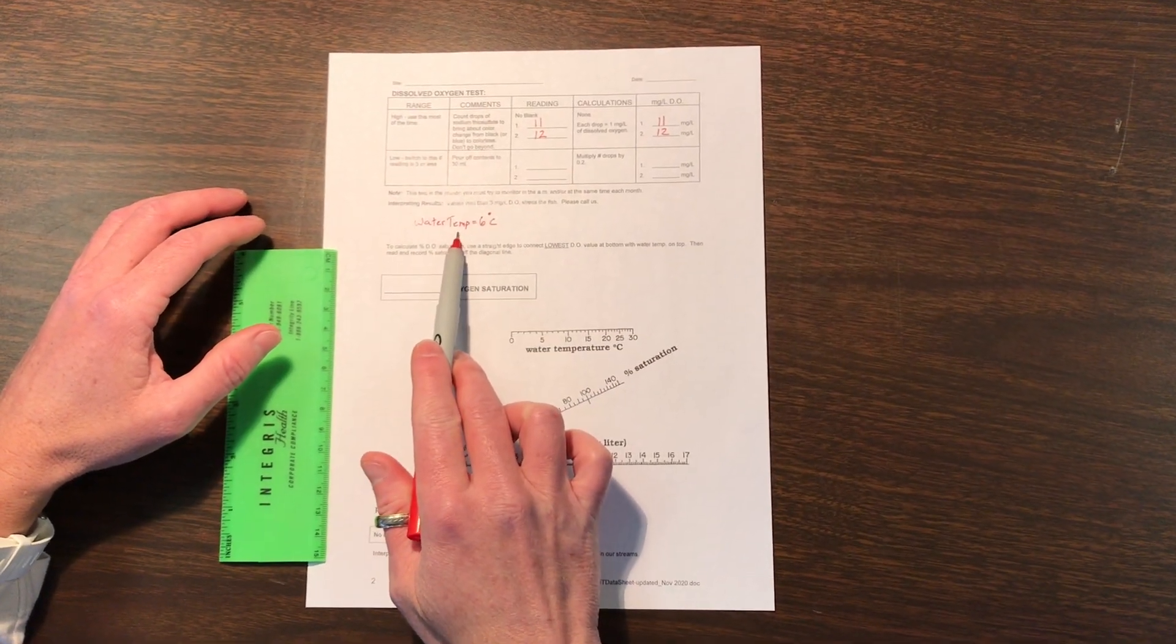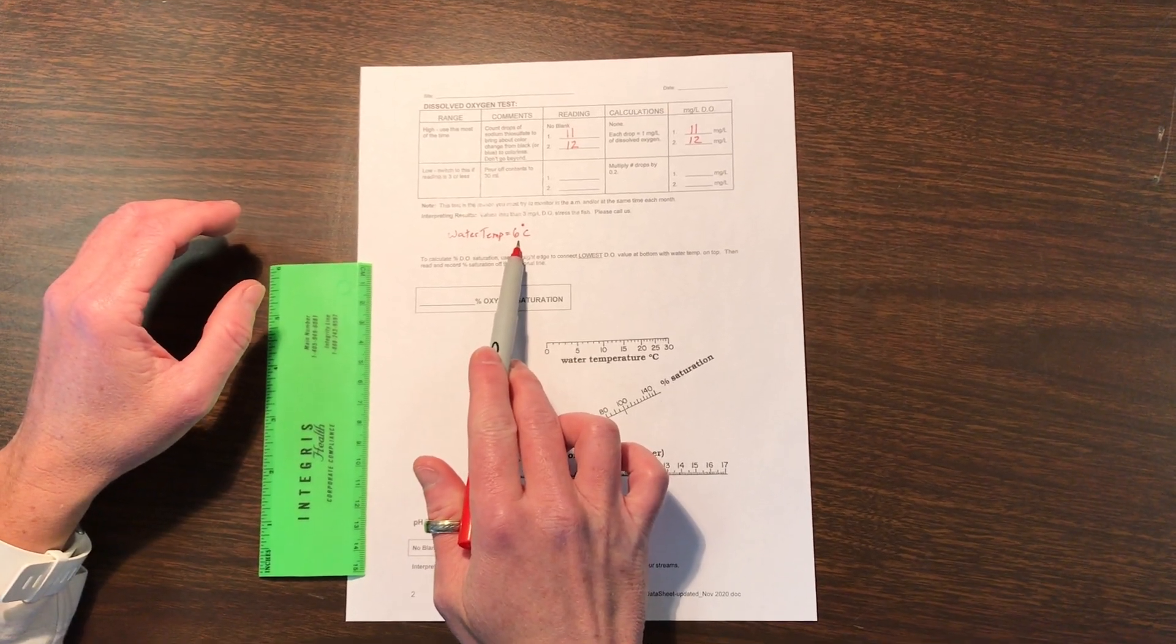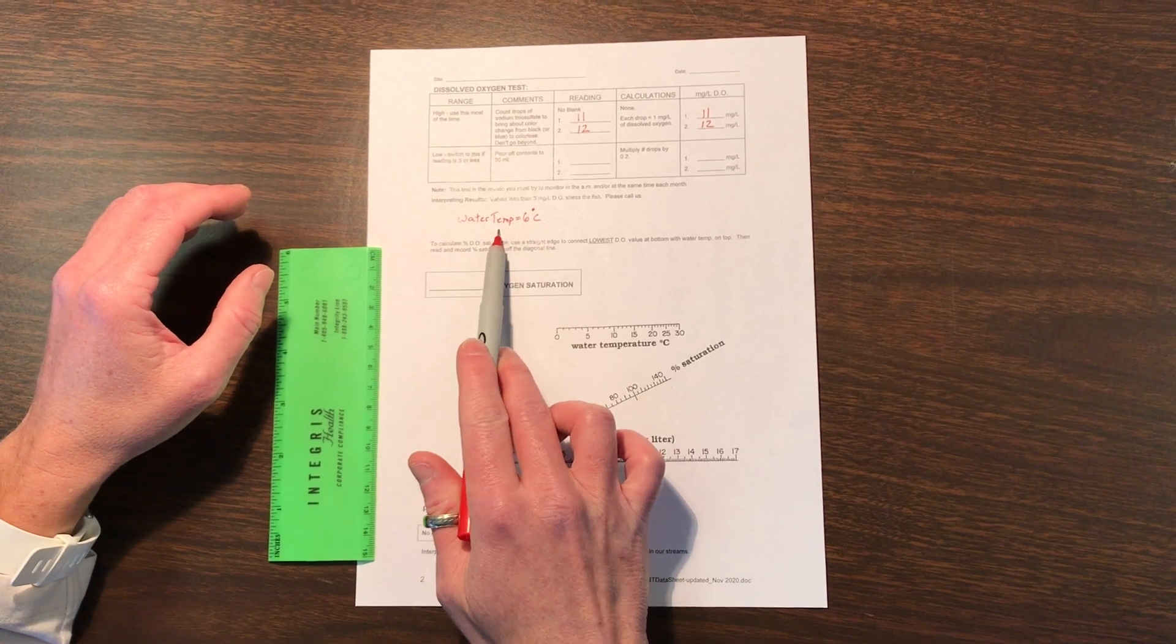This would be recorded on the front page of the data sheet, but I went ahead and just wrote it down here. Let's say that we have 6 degrees as our water temperature.